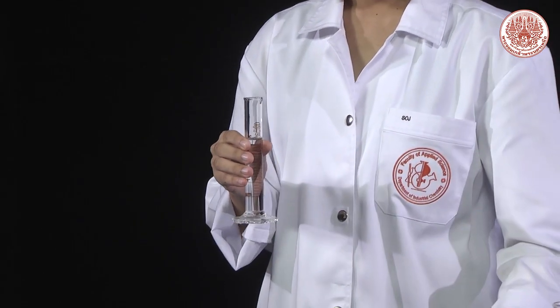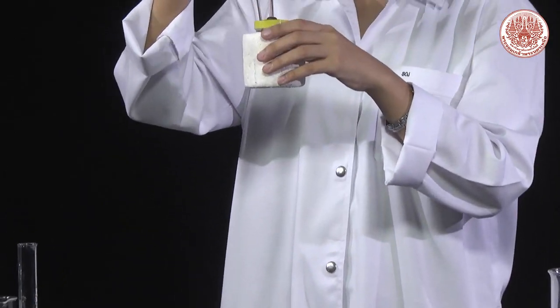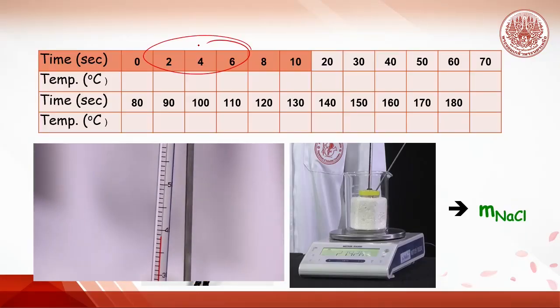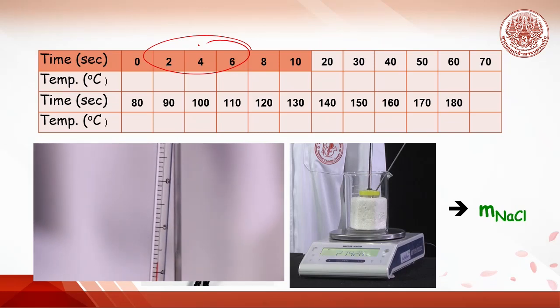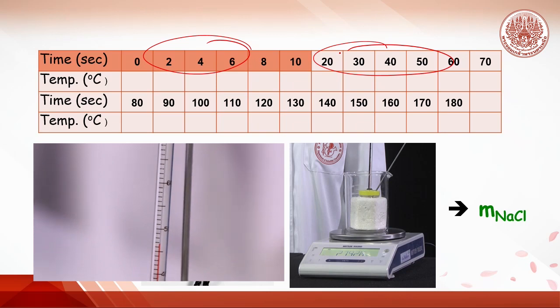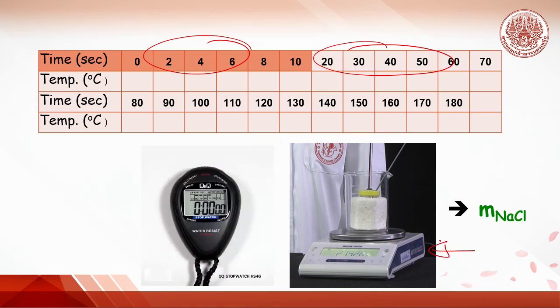Immediately pour the sodium hydroxide solution into the calorimeter. Stir and record the temperature every 2 seconds in the first 10 seconds, then every 10 seconds for 3 minutes or until a steady temperature is obtained. Record the weight of the calorimeter set containing the product — sodium chloride solution and water. After curve plotting, the temperature of mixing is obtained.